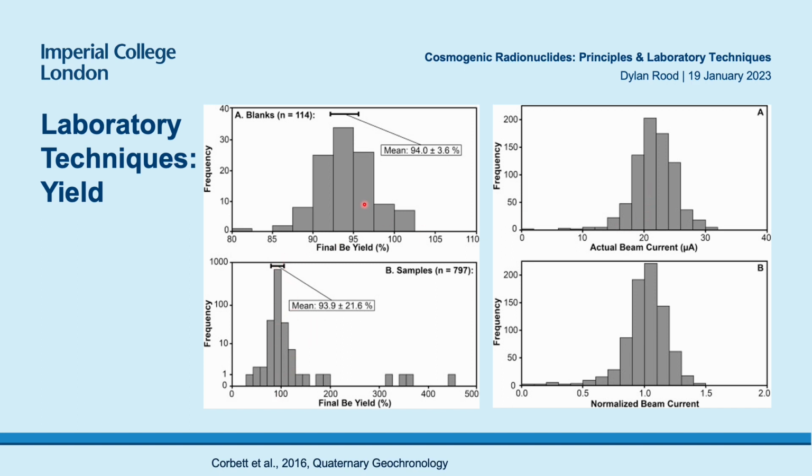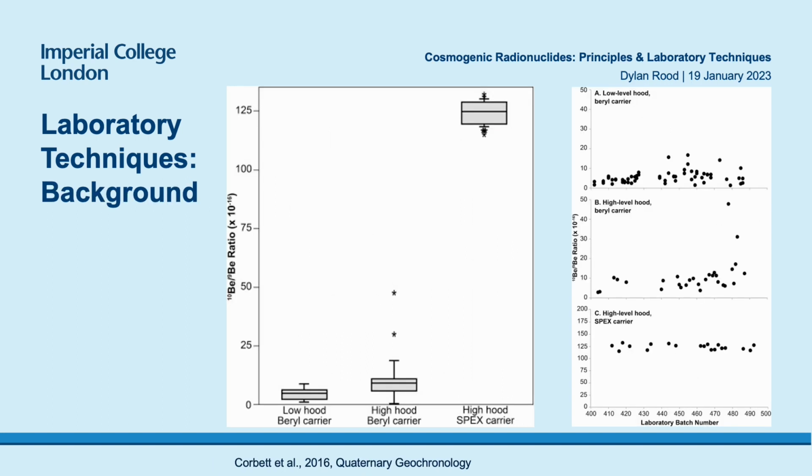And what that means is that when you get that type of quantitative yield coming from the samples, you end up with this, which is basically beam current measured in the accelerator mass spectrometer, which I'll talk about in a second. And these are all basically giving high and reproducible beam currents relative to the standards measured in the samples. And this, again, is essential for coastal applications.